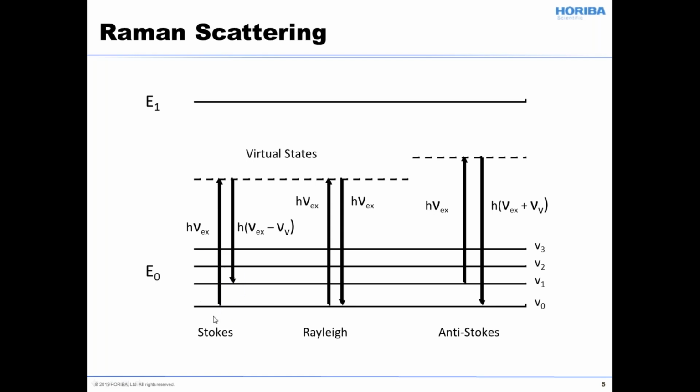So let's just focus on this. Let's say we have a compound, it could be methanol in a vial, and we shine a laser beam in there, let's say 532 nanometer light. We shine a laser beam into the methanol. There's no absorption, and so it doesn't reach the first electronic excited state. There's no absorption.